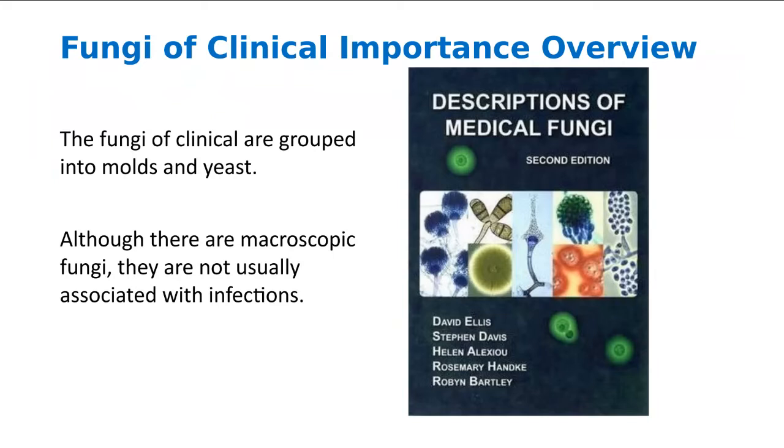So there are lots of books and lots of texts that have been published to help people identify fungi. I have a book that's just on yeast, and it is about the size of the biggest book you can think of, right? It's huge. But that's just yeast. There's all these other things that are molds, right? And so we're going to be looking at those particular structures in just a minute.